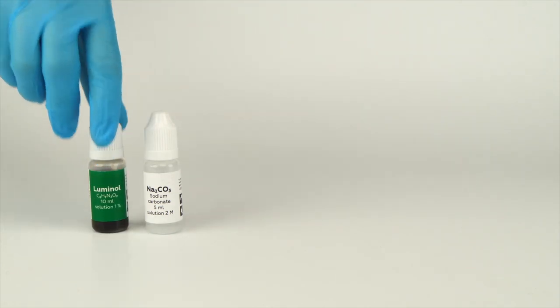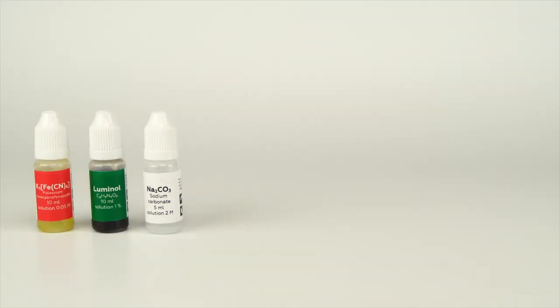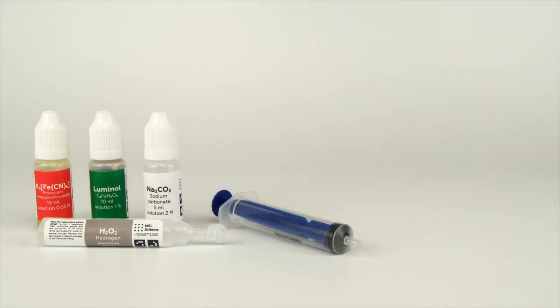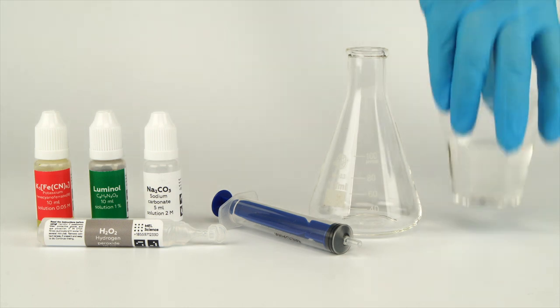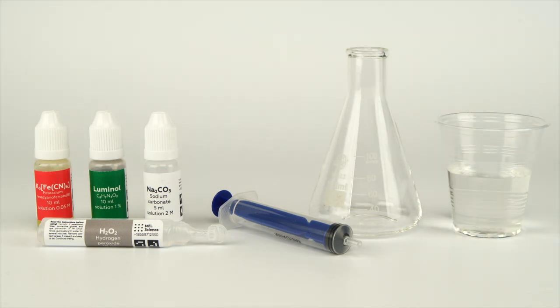For the galaxy in a flask experiment, you will need solutions of sodium carbonate, luminol, potassium hexacyano ferrate, and hydrogen peroxide. Take a syringe from the experiment set and the flask from the starter kit. Also, prepare a cup of water in advance. Conduct this experiment in a room that you can easily make very dark.